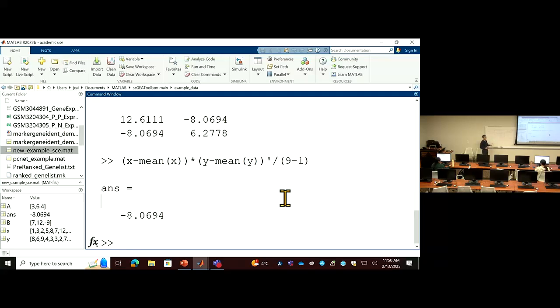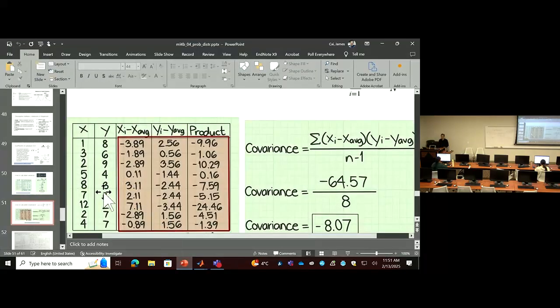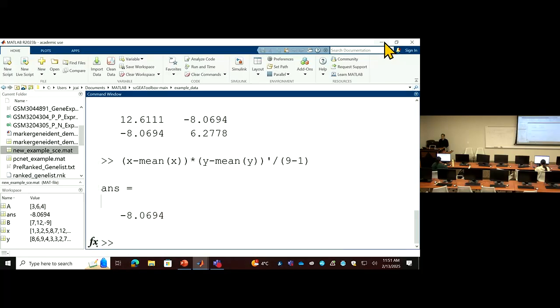You can just use the raw data to get the distance. Why can you get a distance? The reason is the formula we had last week.